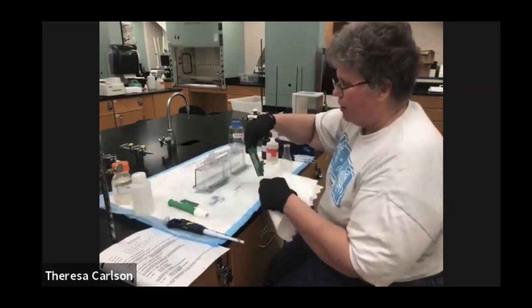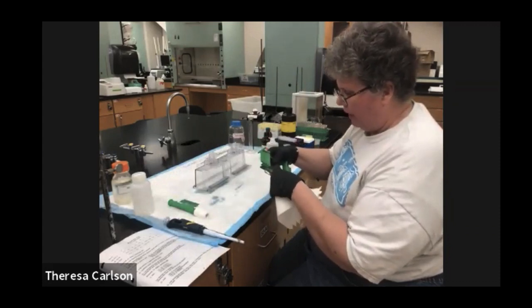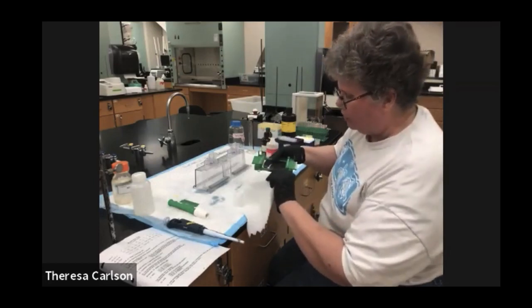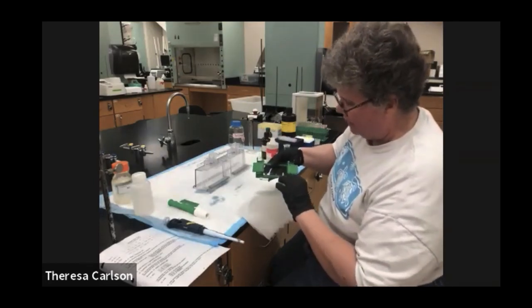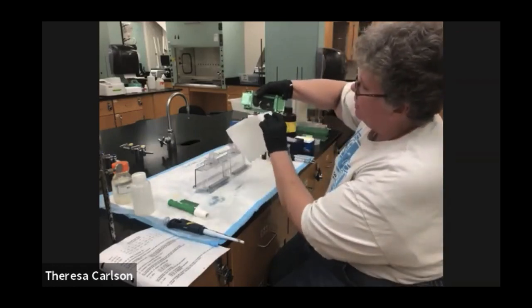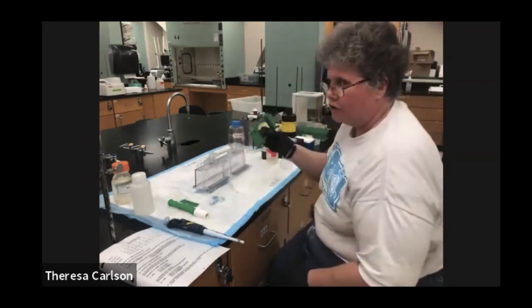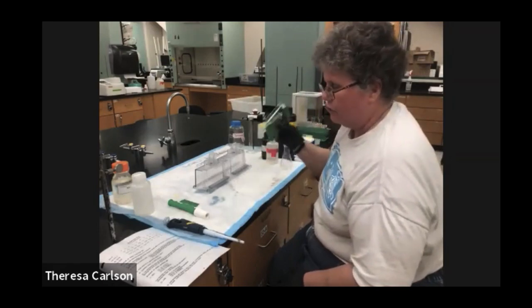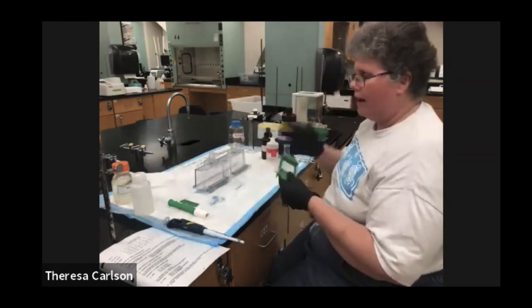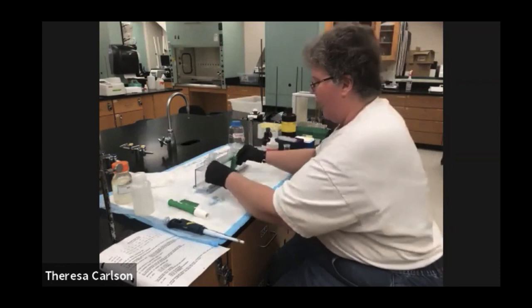Then you want to get all the excess water out. To do this, just take a piece of paper towel in between the two glass plates to sort of get any extra water out. Just remember, you don't want to touch the gel with the paper towel. So you can get it close to the gel, but don't actually touch the gel. Just get sort of close, because gel versus paper towel, gel's going to lose. You're either going to stick pieces of paper towel onto your gel, or the paper towel is going to pull away part of your gel. Either way, you don't want that. So then you're going to put this back in the holder.